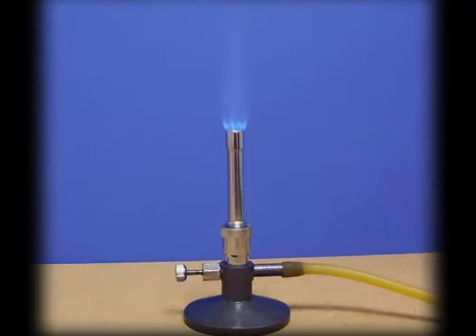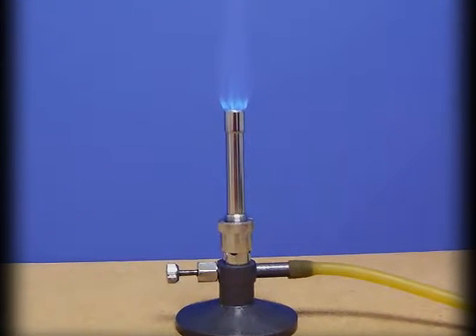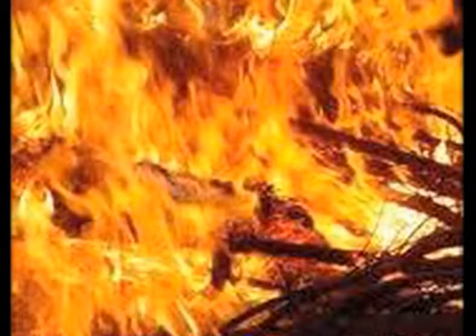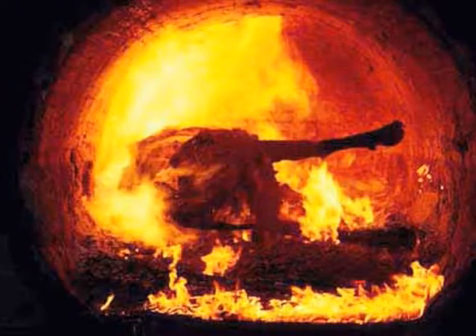The Bunsen burner has a temperature high enough to kill all the microbes present. We also use incineration in hospitals, wherein disposable gowns or OT items are destroyed first by incineration, and only then are they discarded into the environment.